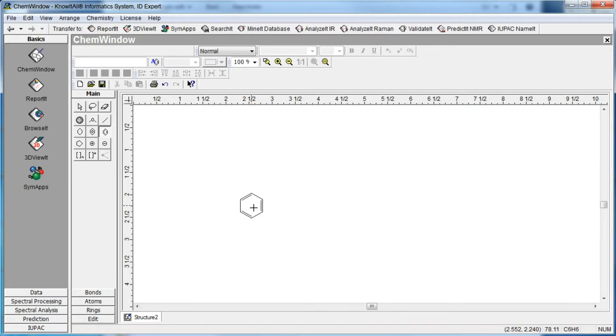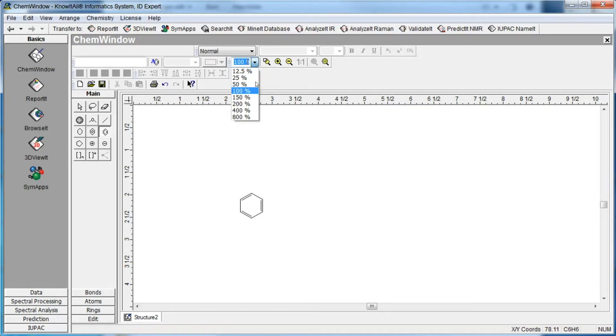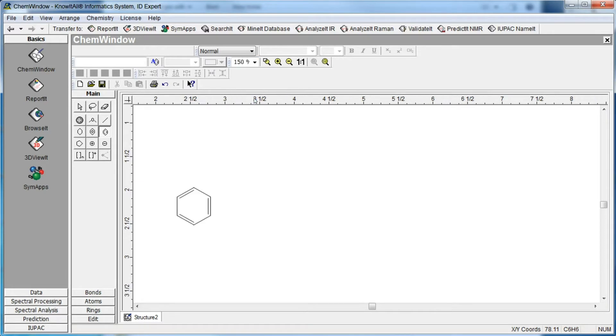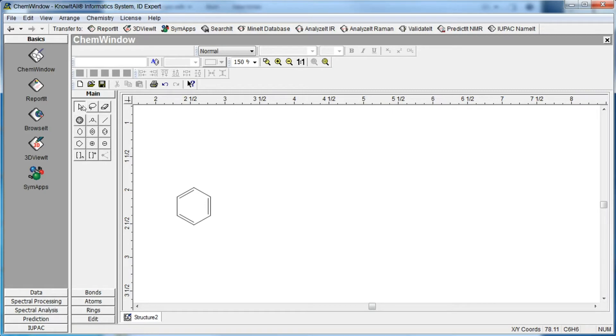We can use tools on the zoom toolbar to zoom in for a better view. Next, use the selection tool to move the structure in the workspace. Click to select the structure. Graphic handles appear around the object. Click and drag to move the structure.